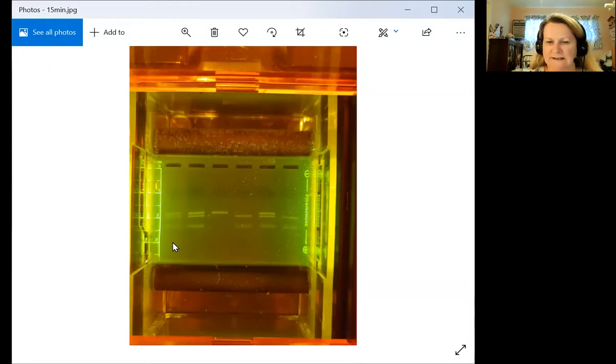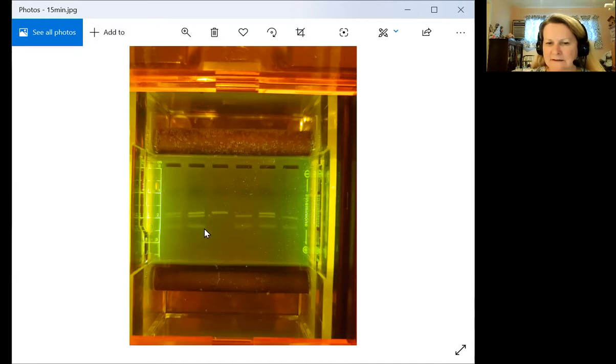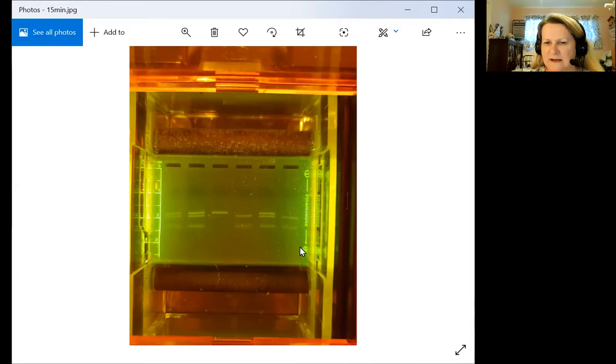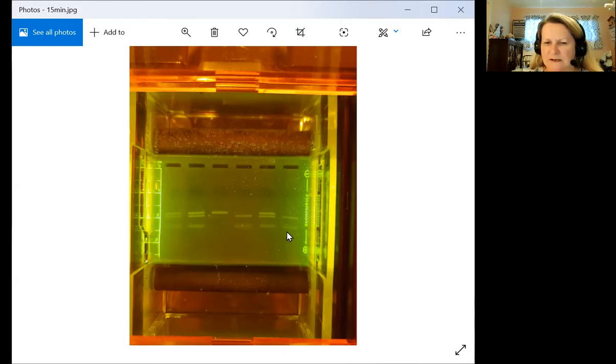Let's take a look at this. This is after 15 minutes. This down here is kind of a shadow band. Sometimes if you have the DNA degrading and you have these little pieces that are showing up of broken down DNA, that's what that is.